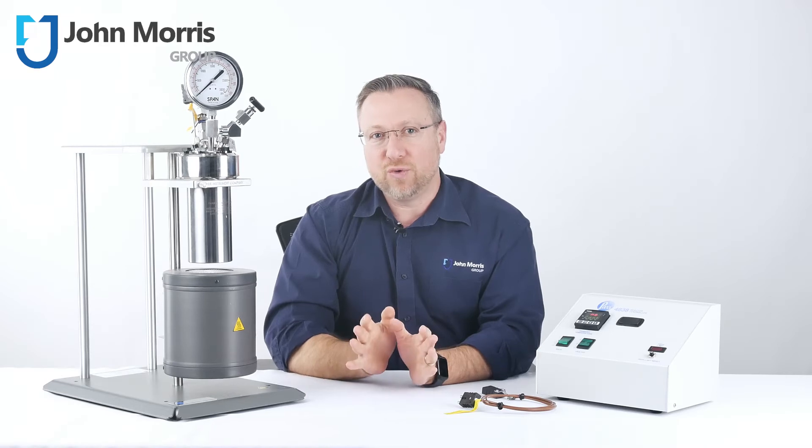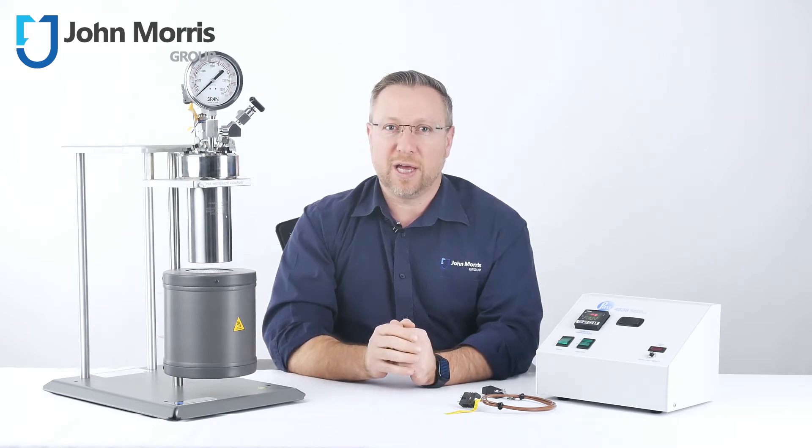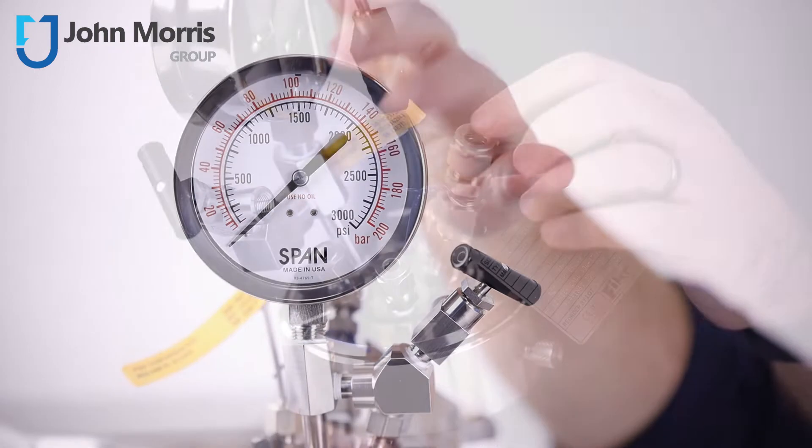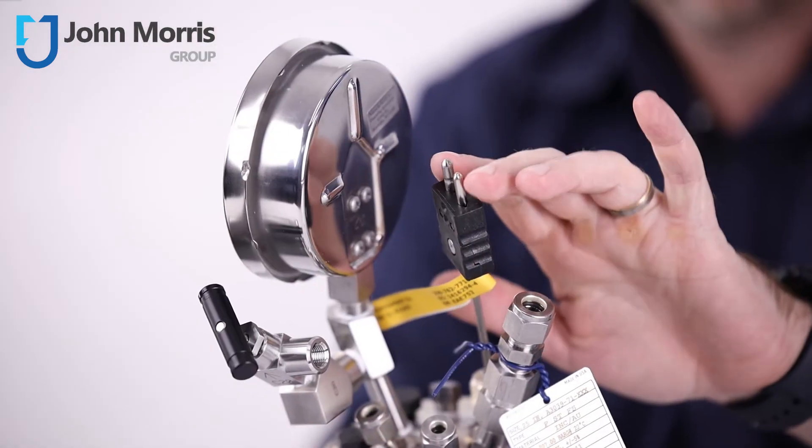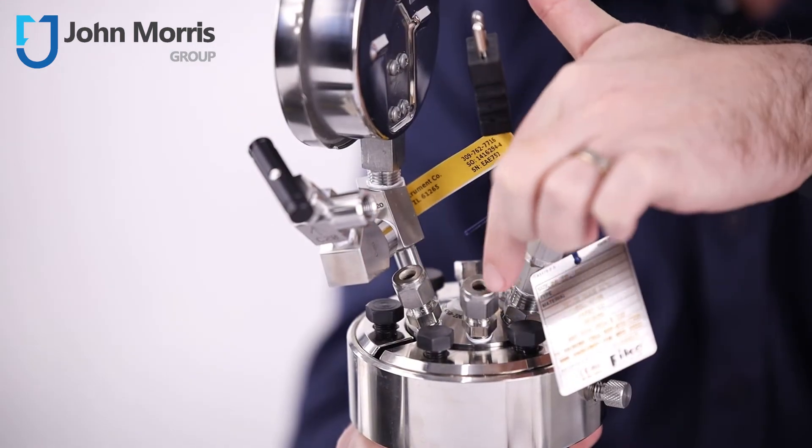The head fittings on this reactor include an analog pressure gauge with an inlet valve on the side. You've also got an over-pressure rupture disc assembly, a thermocouple for temperature control, and ports for cooling water inlet and outlet.